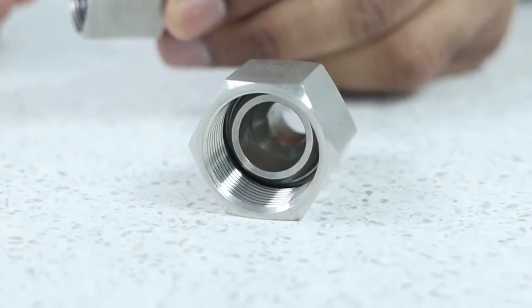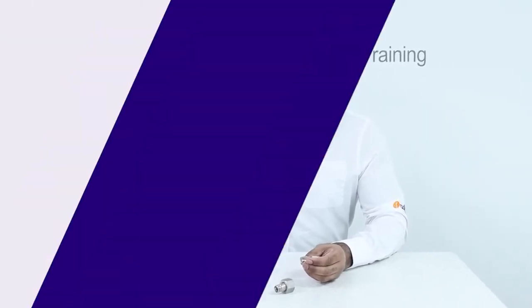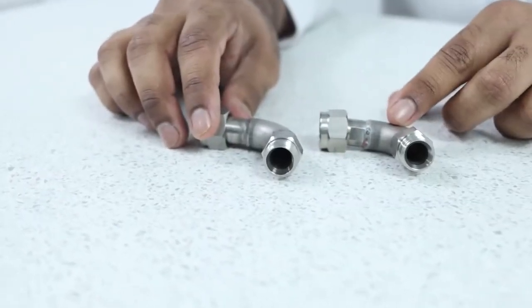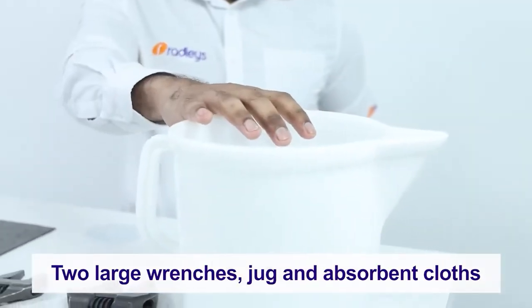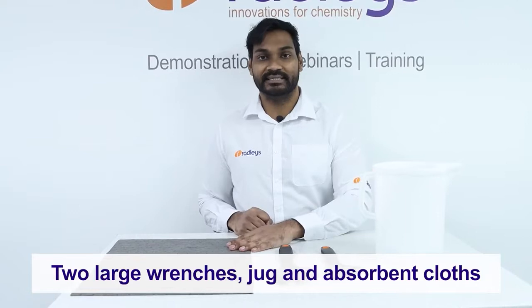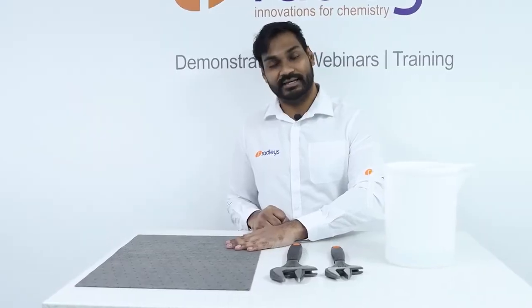We've got M24 female to M16 male adapters, and we'll attach these to our reactor ready manifolds in order to connect them to the hoses. We've also got 90-degree M16 adapters which we're going to fit to our MiniStat. The tools you need for this installation are two large wrenches, a jug for filling up your circulator, and in case of any spillage, we recommend having a super absorbent mat to hand.